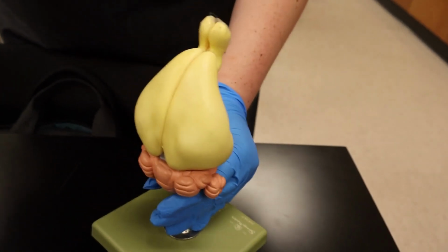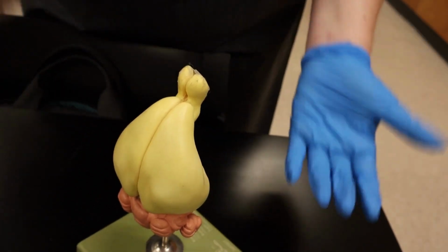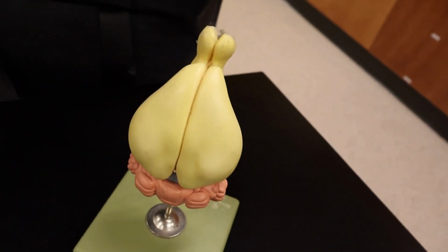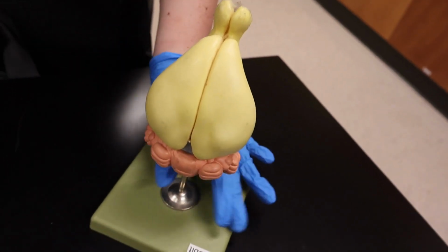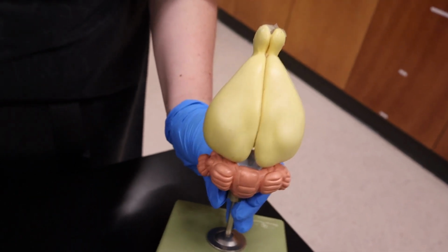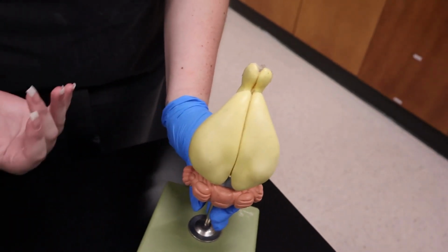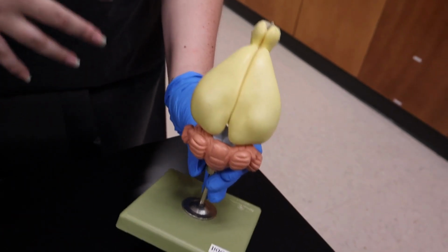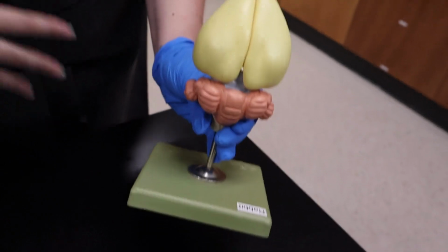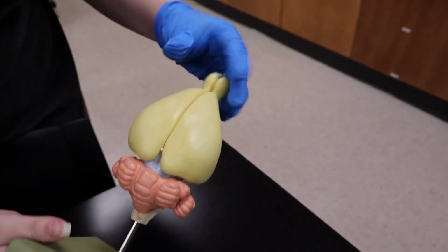Okay, so this is going to be our nervous system. So the nervous system consists of the sensory organs that we just talked about, being the eyes, ears, etc. And then the brain is also going to be the other part of that nervous system. So we will be cutting open the skull of the rabbit and showing you the brain inside of its cavity in the skull, but I am going to do a breakdown of the different parts of the brain and their different adaptations and what they are important to the rabbit for.